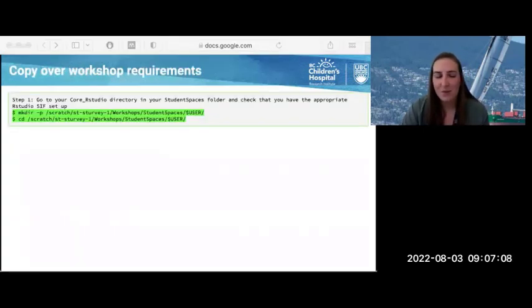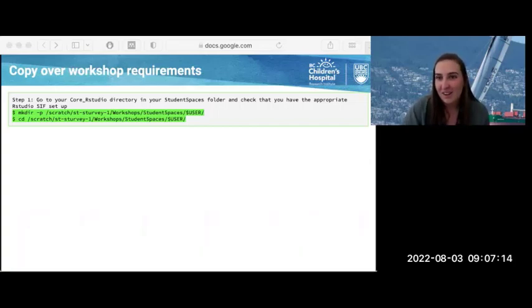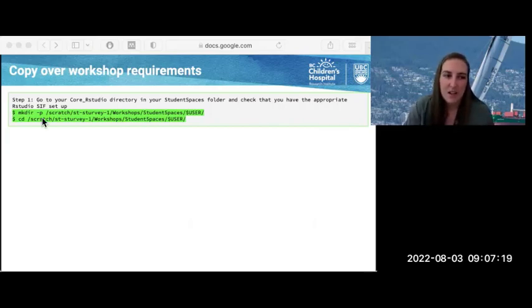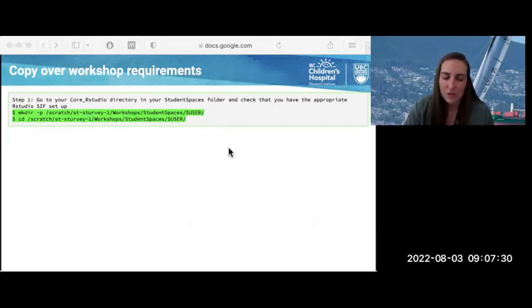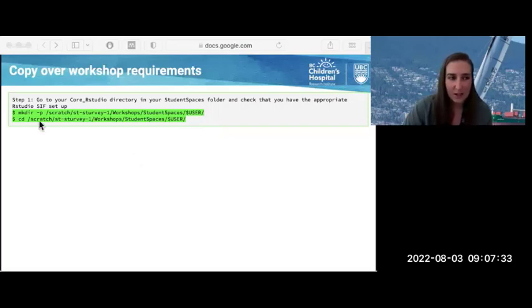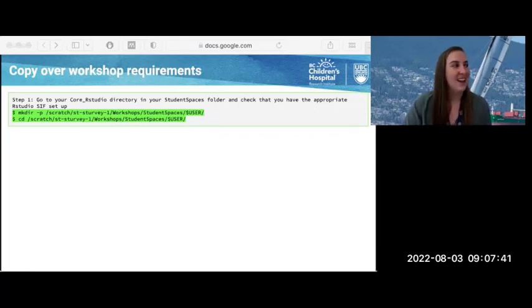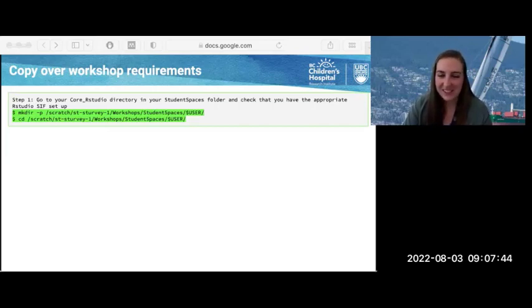If you could please run these two lines. Run the script in the folder if you're on Sockeye, which everyone should be logged into by this point. This first line, you're just going to make a directory if you don't have it made yet — you can type this out into your command line, and it's going to make a folder with your name under student spaces. Once that's made, change into that directory with this second line. Give me a thumbs up once you're done so I can get a sense of everything that's finished.